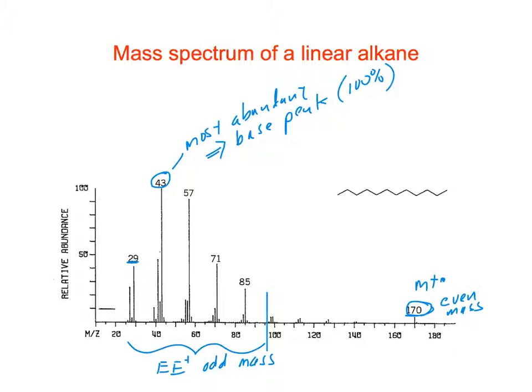Like 43 has a really small one and a tall one, but 57 has a really tall one. That just means there's another, separate ion forming there, so there are always going to be some we can't account for. The isotope pattern, yes, we'll get to that.